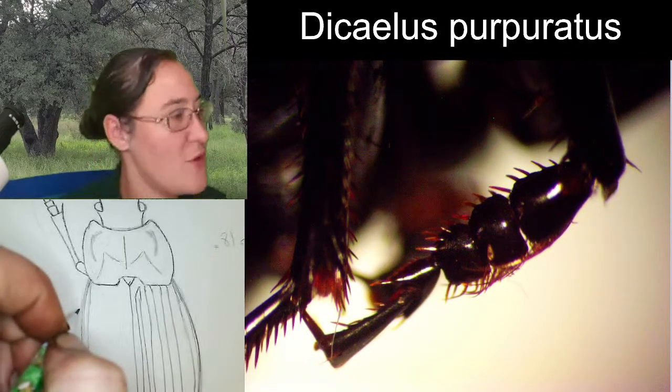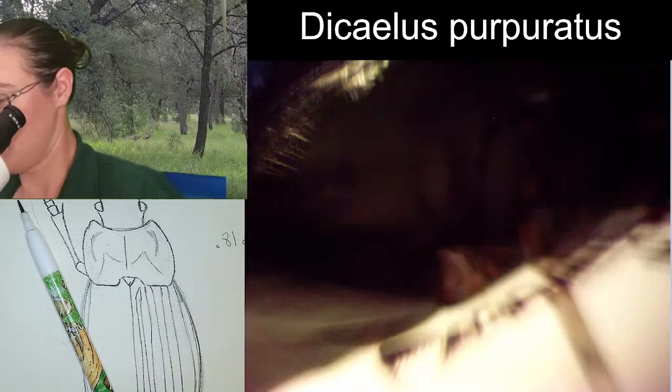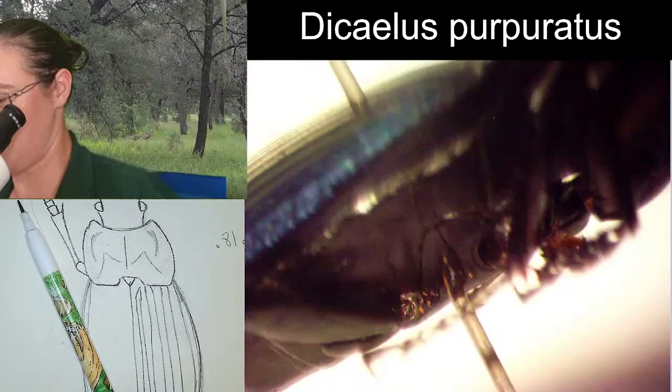All right, for our middle leg here. The middle leg is actually positioned correctly.